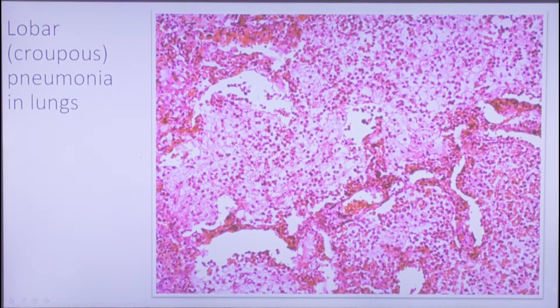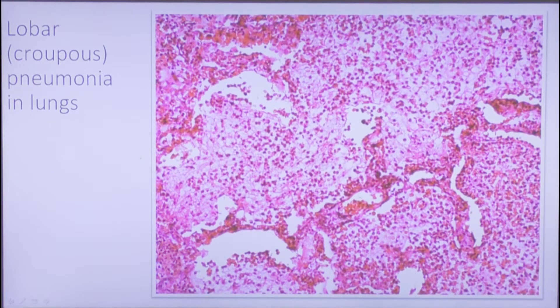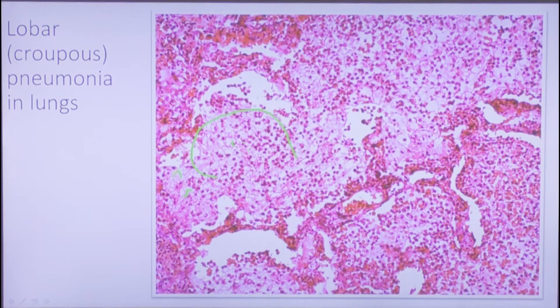Here is lobar pneumonia. All alveoli are filled with dense exudate in which we see many neutrophils and a lot of fibrin, which looks like thin threads. That is why we classify this type of inflammation as fibrinous.